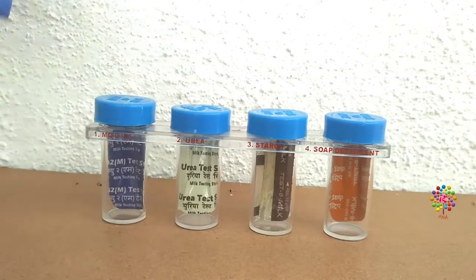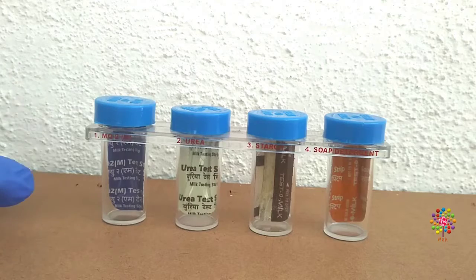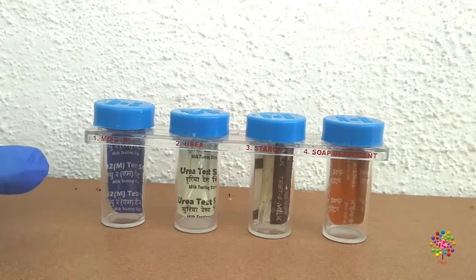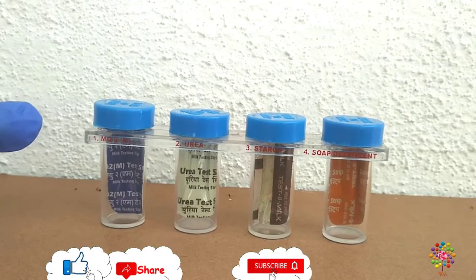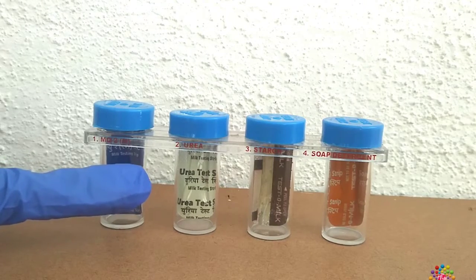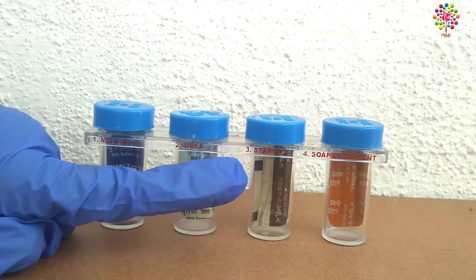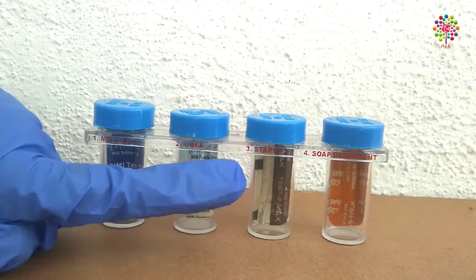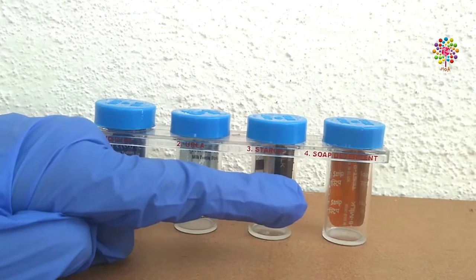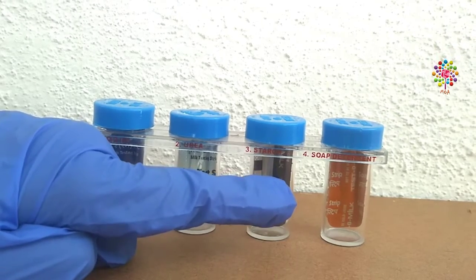All the 4 test tubes are used to check the purity of milk. This first one is MQ2. MQ2 means microbial quality check 2. The second one is used to check urea in the milk. The third one is used to check starch in the milk. And last, the fourth one is used to check soap or detergent in the milk.